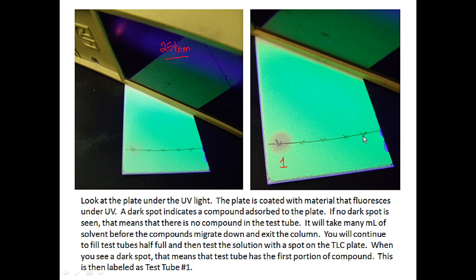You might have 3, 4, 5, 6, 10 TLC plates because you're going to spot every test tube from here on out. So this is test tube number 1. Test tube number 2 will be spotted here, 3, 4, and 5, and then on down the line. A new plate for every 5 or 6 spots, depending on how big we cut the plates and how closely you space your X's.